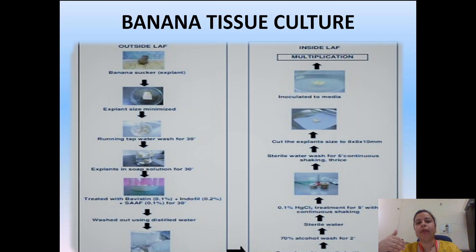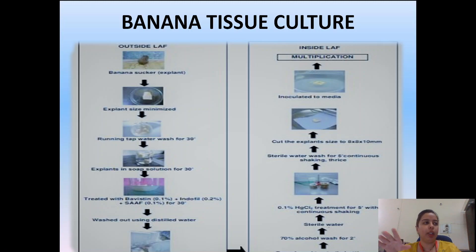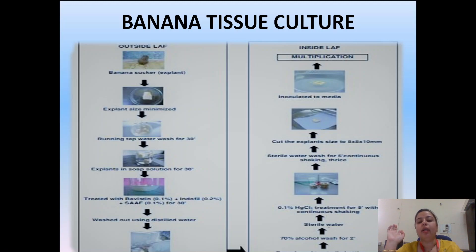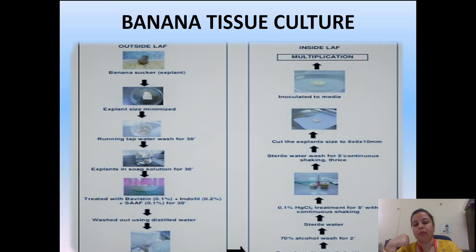After 30 minutes, take it out and wash it using distilled water. The explant is now ready and we go into the laminar airflow cabinet — class 100 chamber — where we transfer the explant to a sterile bottle. The sterile bottle is sterilized using autoclave. Then wash the explant for two minutes in 70% alcohol, followed by a final wash with sterile water. Next, 0.1% mercuric chloride is applied to the explant with continuous shaking for five minutes.